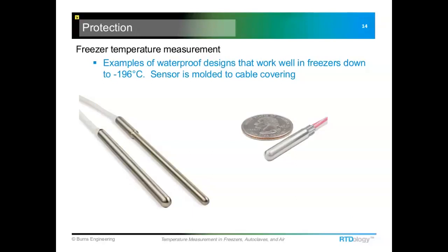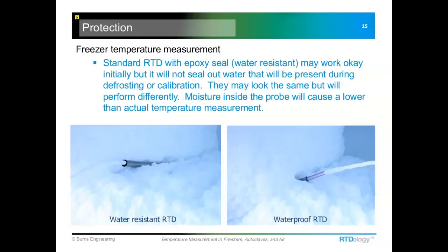And then they also have an epoxy seal in the back end just to keep liquid water from filling up the probe. And you really can't tell by looking at the probes if it's a waterproof one or if it's just a regular one. You just have to make sure that thing was built with the usage in mind.